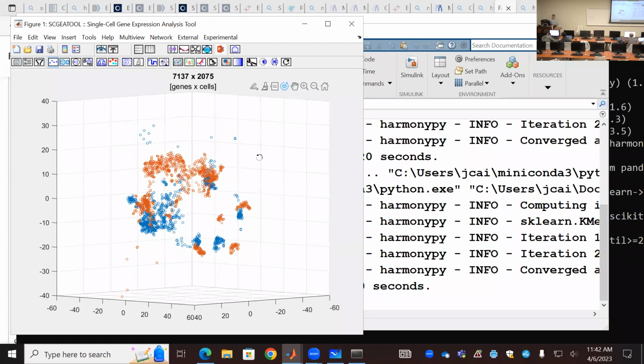When cells move closer together, they may cluster in the same group. You may improve the cell type identification because the cells in the same group change the cluster composition after the Harmony move.